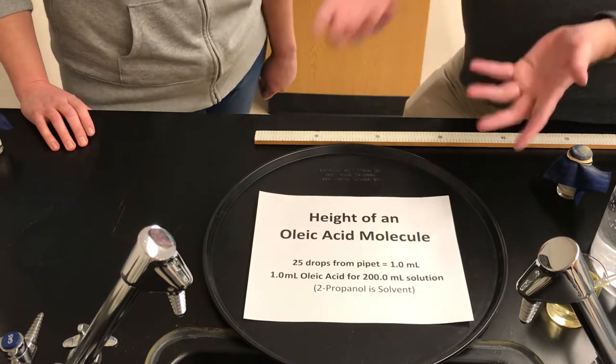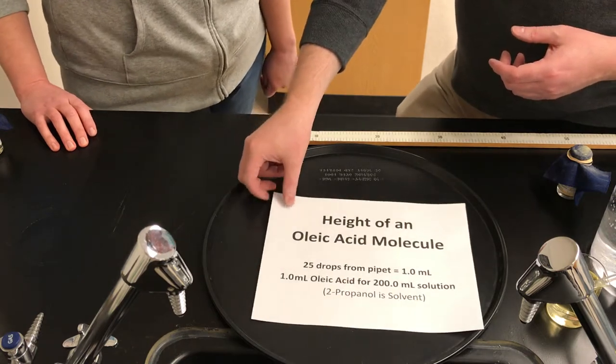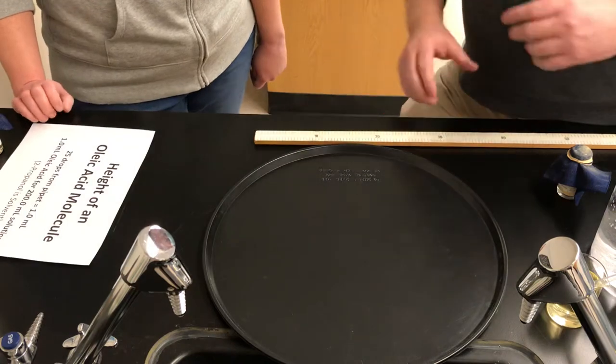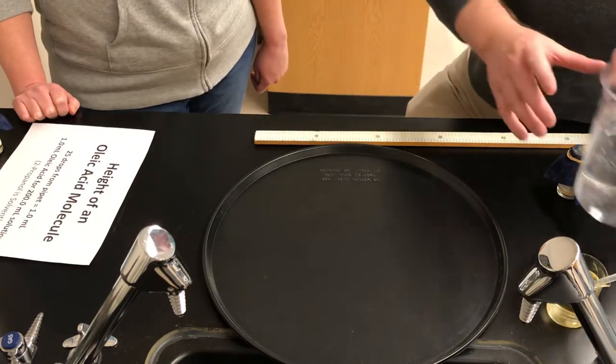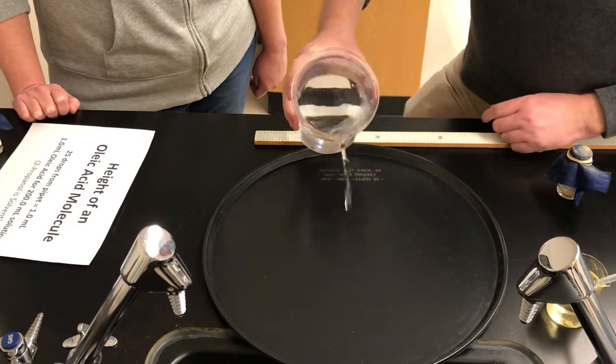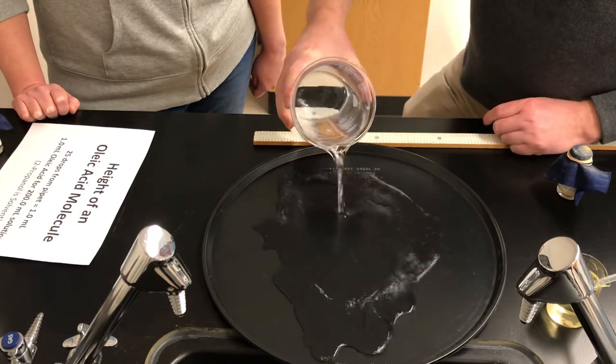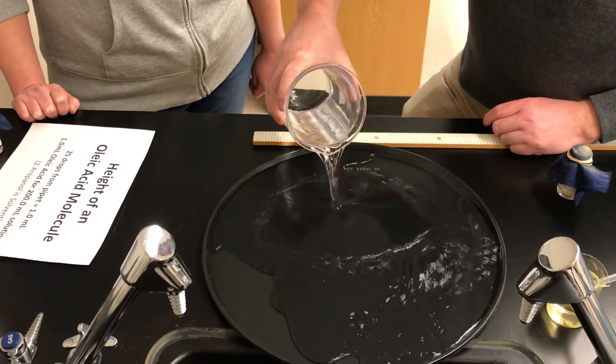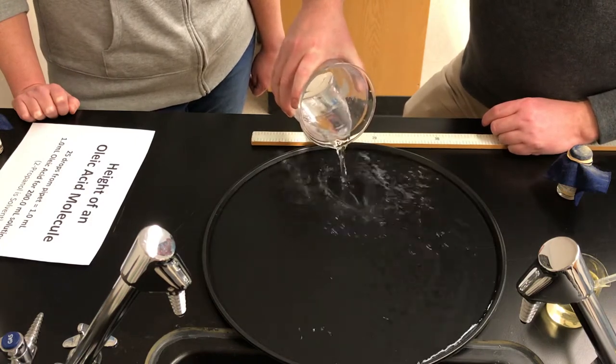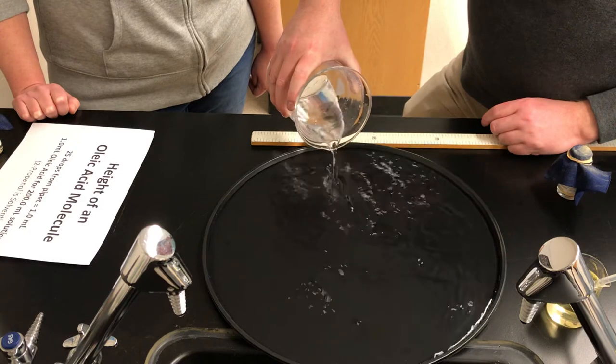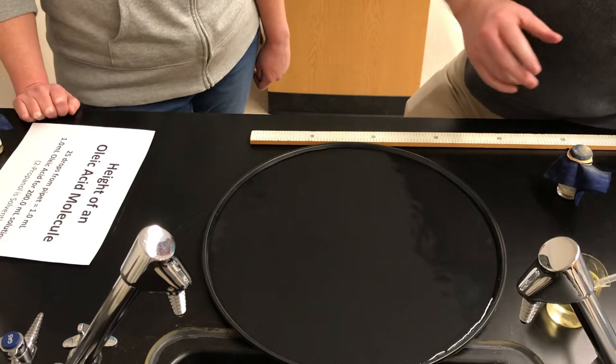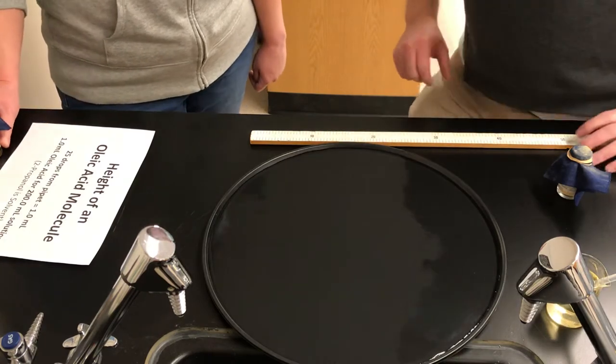So next we're going to actually perform the experiment for you. This is an experiment students do at grade 9 in this unit. We've got a circular plastic tray and some tap water. So I'm just going to pour the tap water into the tray. This is almost a liter of tap water. It has to be deep enough, maybe about half a centimeter deep or so. And now we'll just wait for the surface to settle.